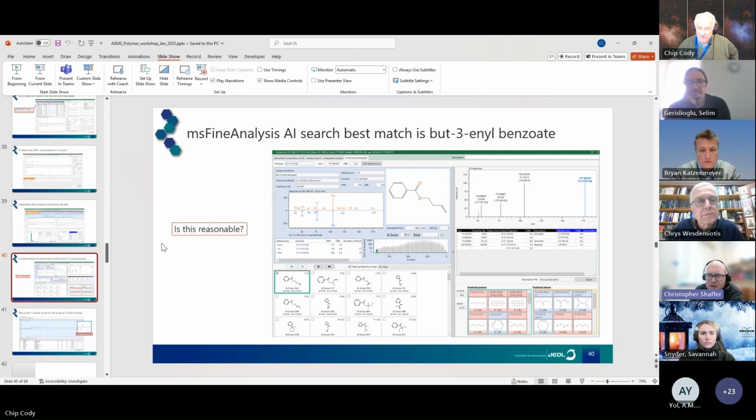And then does it do any binning and aligning based on known compounds in your spectrum as well? You can. The automatic alignment's pretty good, but I have had cases where I've gone back and remeasured something and we'd snipped off some guard column or something like that. And in that case, you have an option to do an interactive chromatographic alignment.